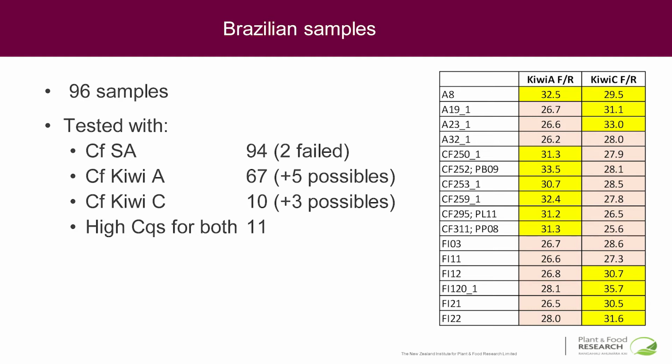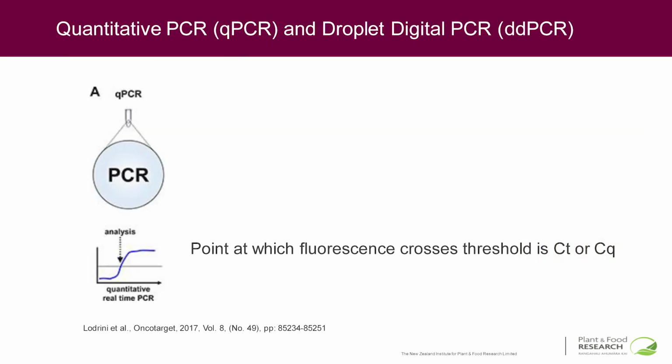But also, you can see here that there are a few in the high 20s for the CT value, and we really would like to know exactly what that means. And so that brings us to the new technology that I alluded to.